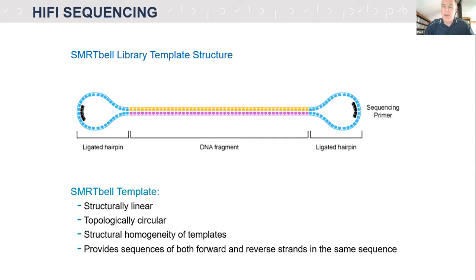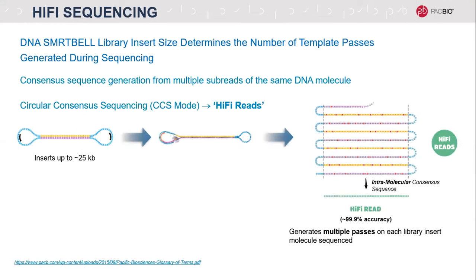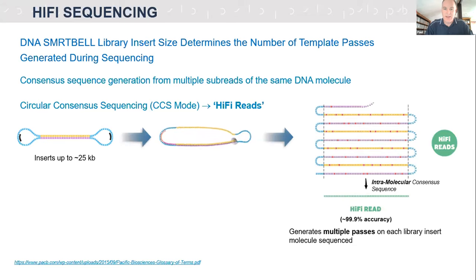But as you can see, because PacBio's reads are so long, you're able to go around these molecules multiple times. And that's what gives you the very, very high accuracy that we have from HiFi data. What I've tried to describe, you see going on in the little cartoon in the middle there. We fragment our high-quality genomic DNA, say around 25 kb, or maybe a little bit smaller for some jobs, it just depends on the applications. Then that polymerase starts to turn into the sequencing engine, and round and round it goes. So the panel on the right shows multiple passes along the same molecule. As I said, you've got a forward pass and then a hairpin and then a reverse complement and then a hairpin and so on. I think there's about eight passes here in this particular example.